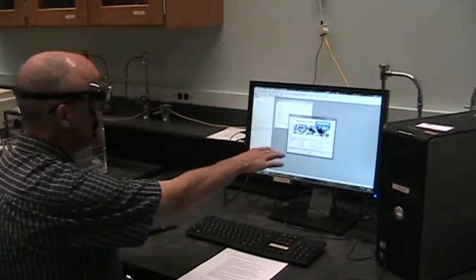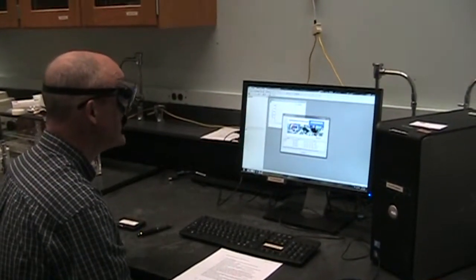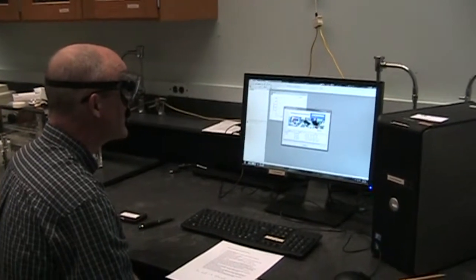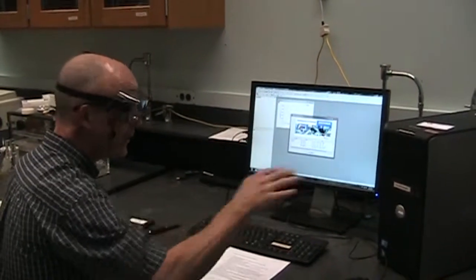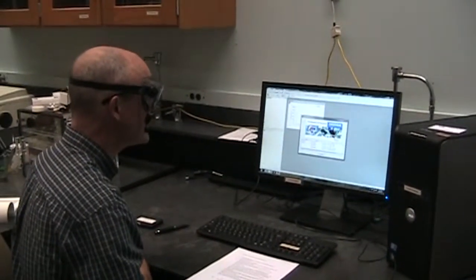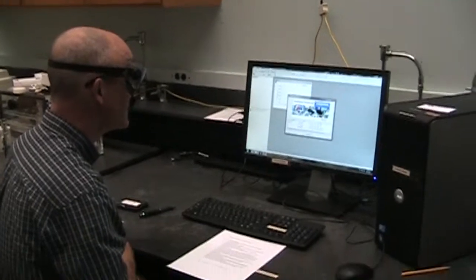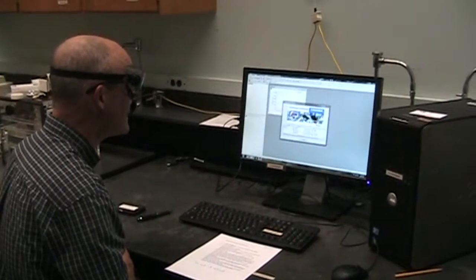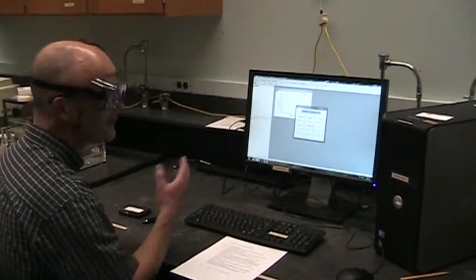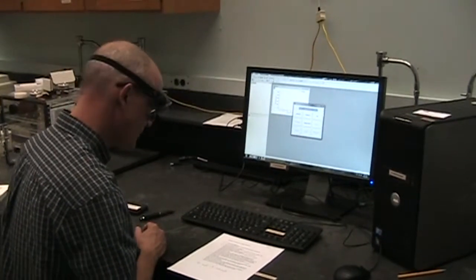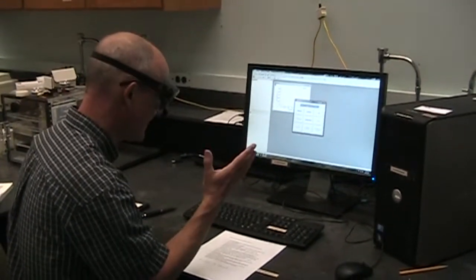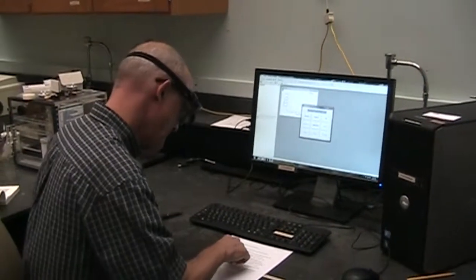This brings us to sort of an initialization screen and you'll also hear some more noise from the instrument as it's turning things on and getting things ready. It takes just a few seconds, a relatively short period of time.